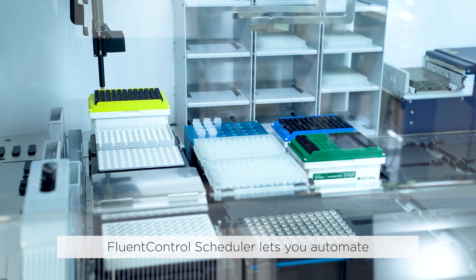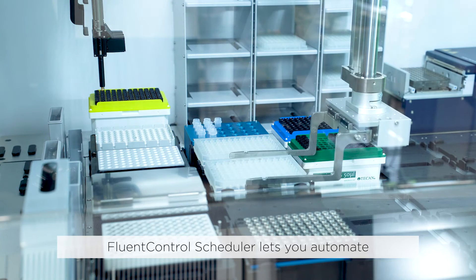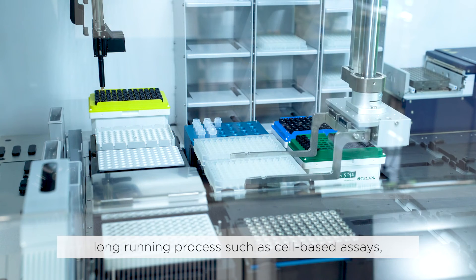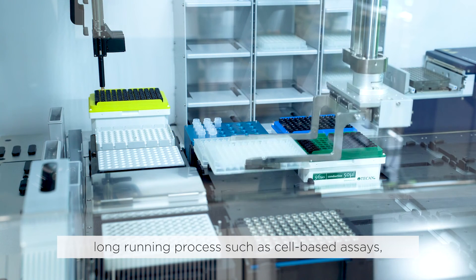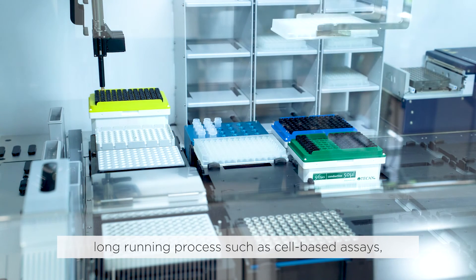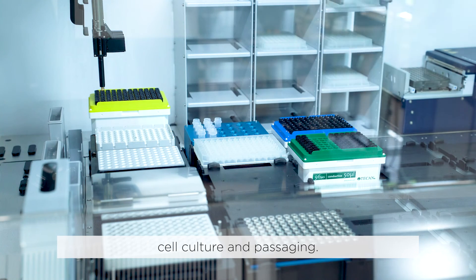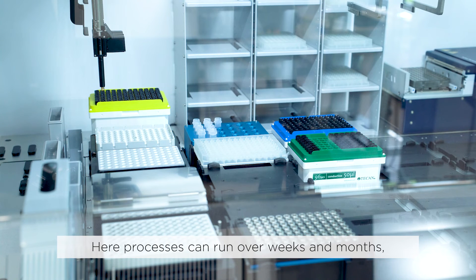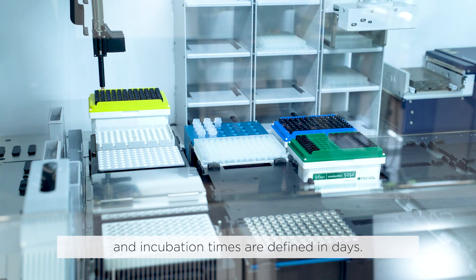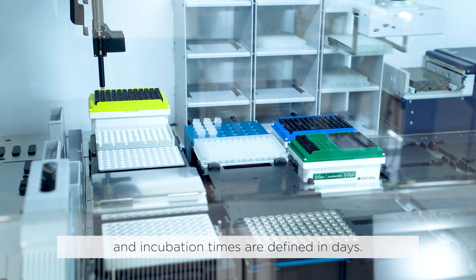FluentControl scheduler lets you automate long running processes, such as cell-based assays, cell culture, and passaging. Here, processes can run over weeks and months, and incubation times are defined in days.